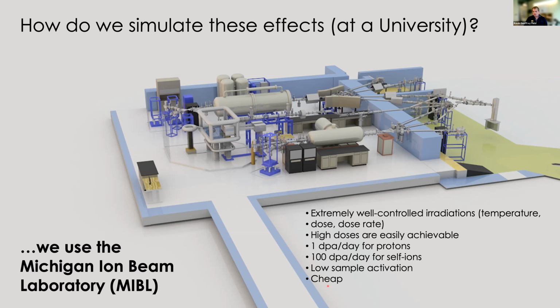And then for me as a professor, the beauty is that they're cheap. They're very low cost, so I can do a lot of different experiments in this process. And so again, this is the Michigan Ion Beam. So we would have sources, an accelerator, you do some optics.